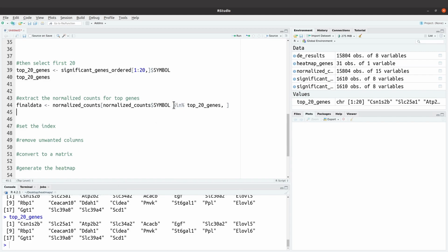So this one here, that's so that all the records that can be found in this one should be returned to us. And then the comma here also adds up to give us everything, because we want all the columns. We want all the records to be returned to us. That's basically what we are doing here. Okay, so now we can proceed. That is the rationale behind this command. So don't be scared, don't be afraid of this one here. It's just a simple instruction. Now that we are clear, we can proceed to do the extraction.